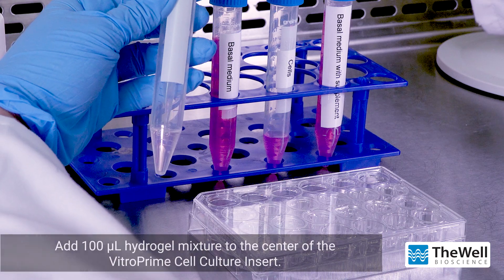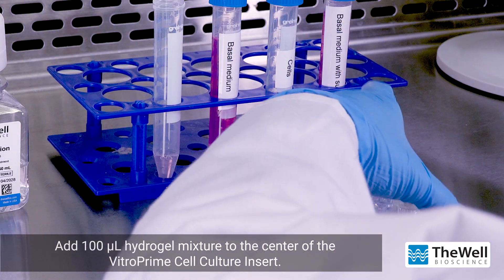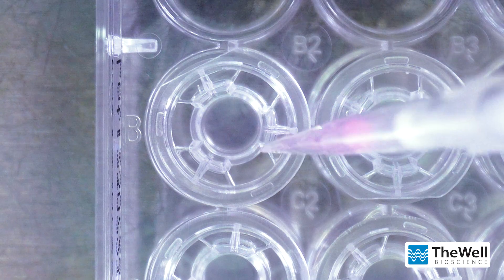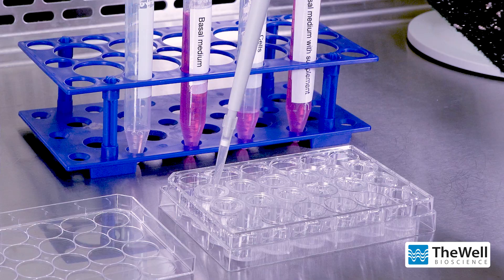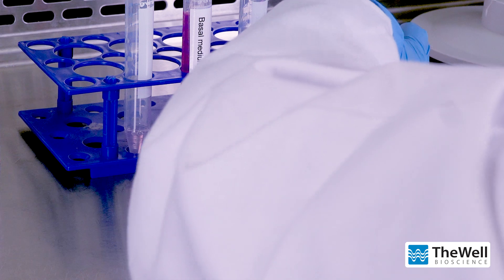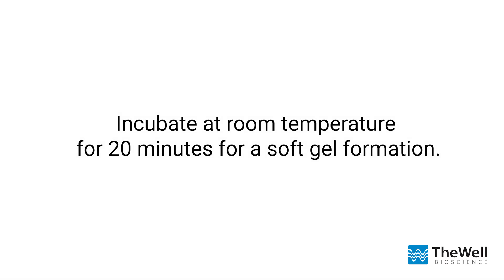Add 100 microliters of the hydrogel mixture to the center of the Vitro Prime cell culture insert. Ensure there is an even hydrogel covering on the surface of the insert. Incubate the plate at room temperature for 20 minutes to allow for soft gel formation.